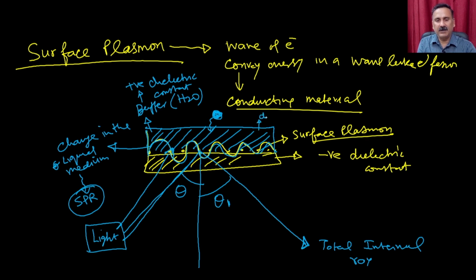This is going to give you multiple rays, right? But at a particular angle, there will be a complete absorption of this particular light, and that's how at that particular angle, you will see no light. Okay, or you will not see any of the reflected light.